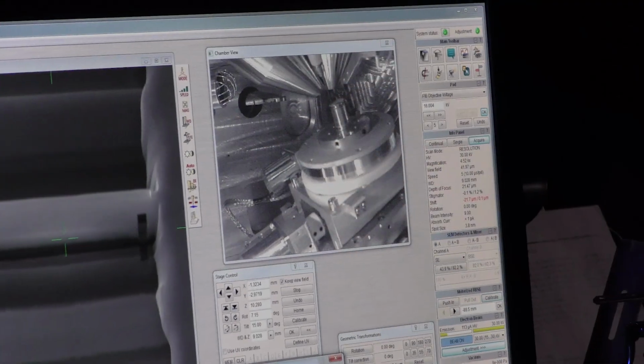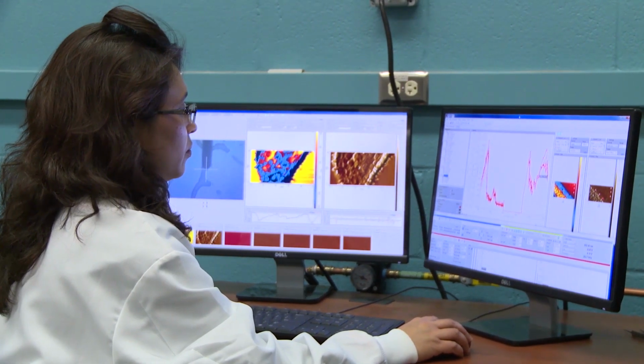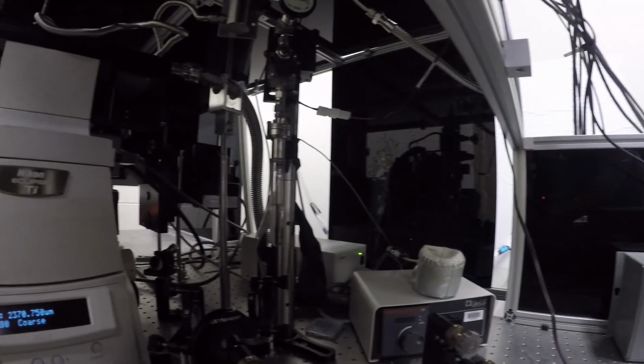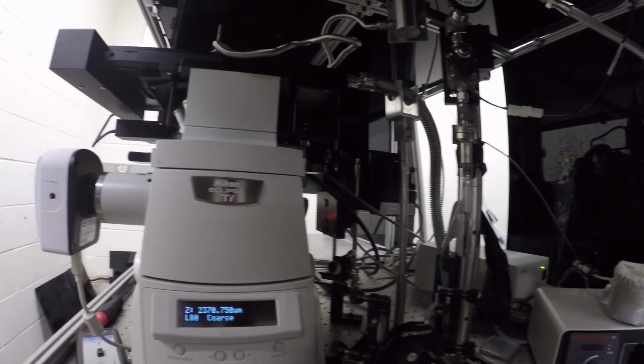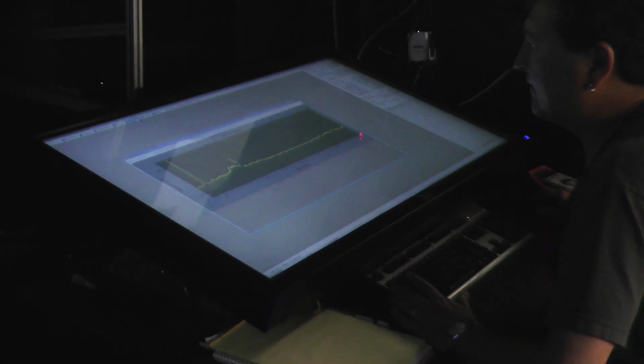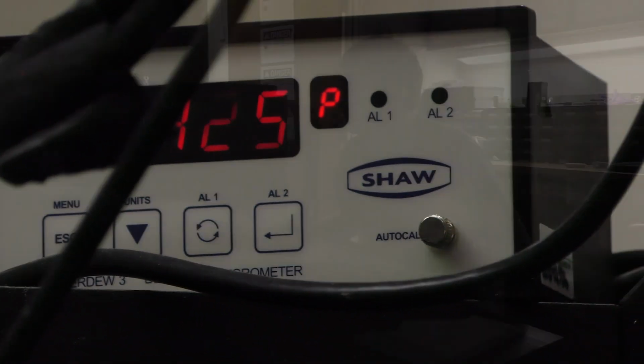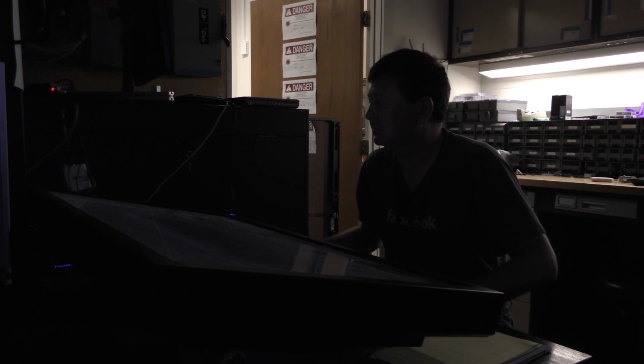In the future, we hope to be able to design the material in the computer itself. And the way we've been approaching the problem is by building a robot researcher. So this is a tool that we've developed called ARES for Autonomous Research System. And it's something that can conduct an experiment, it can see what happened, then feed it off to an artificial intelligence module, and then make a proposal about what experiment to do next.